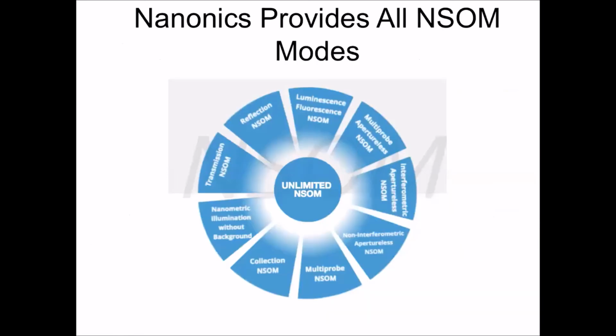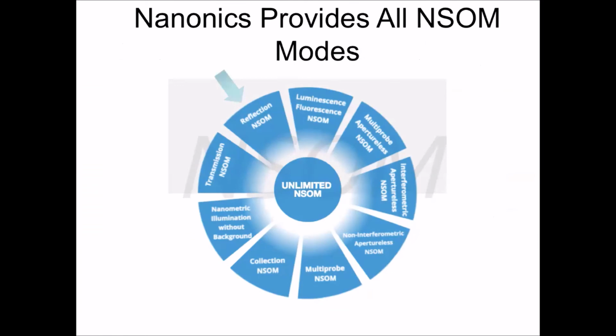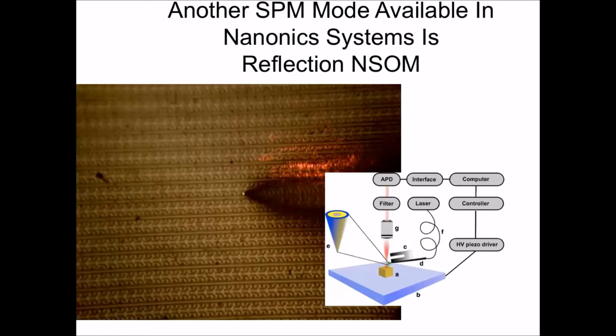And now we come to near-field optics, okay? And near-field optics is a flower that has really exploded over the years, okay? And I'm going to just take a few of these flowers just to give you an idea. The first flower that I'm going to take is reflection, okay? I'm going to show you what a near-field optical microscope is.